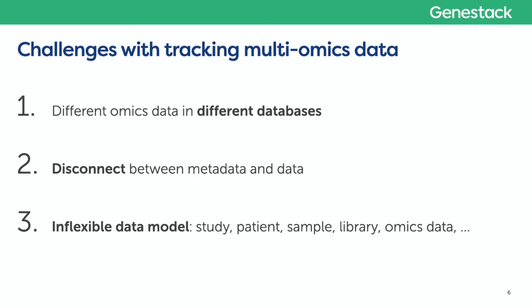For example, you can have a LIMS or ELN system for recording all the experimental data while your actual data stays elsewhere in another system. Also, some systems do not have a data model that supports different types of data, which can cause issues in locating, searching, and linking them.